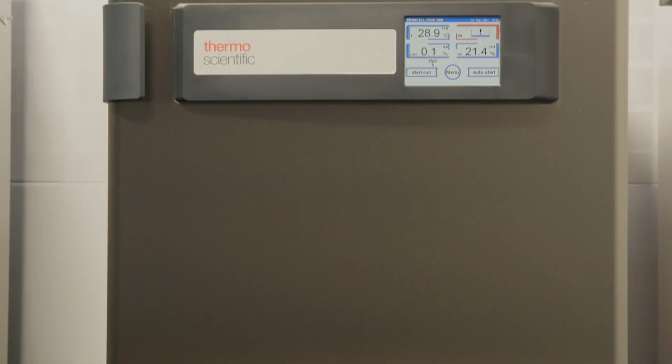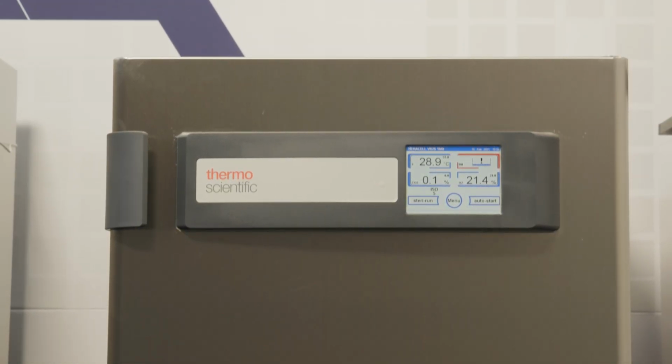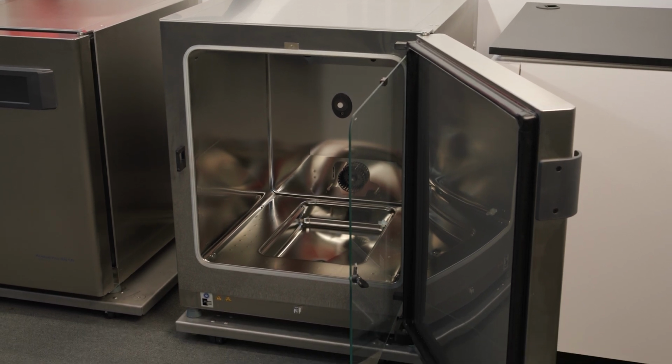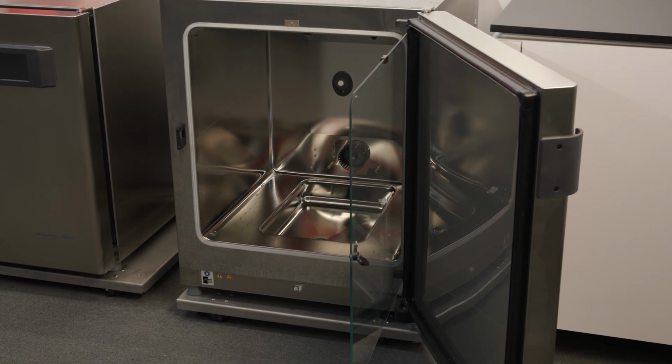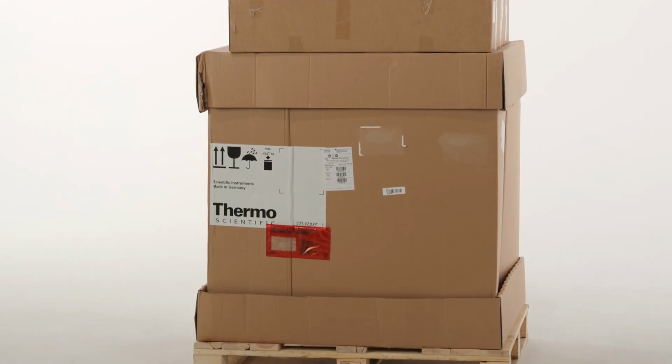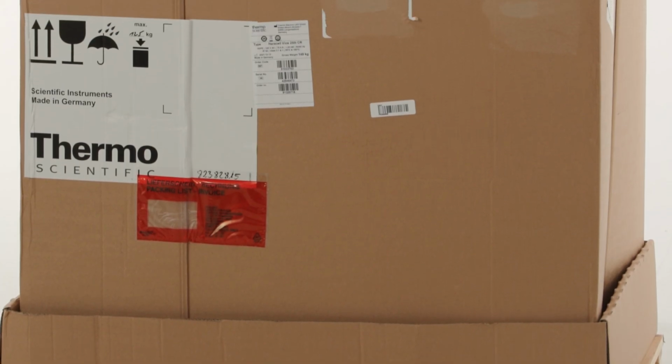In this video, we'll show you how to set up your Heracell VIOS 160i or 250i CO2 incubator. Heracell VIOS CO2 incubators are delivered in a stable packaging box. All packaging materials can be separated and are reusable.